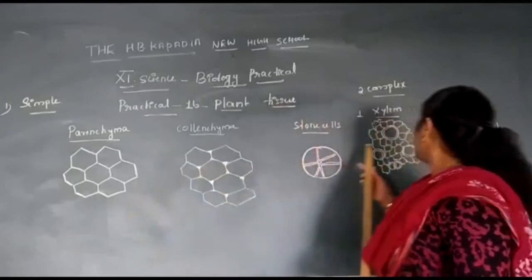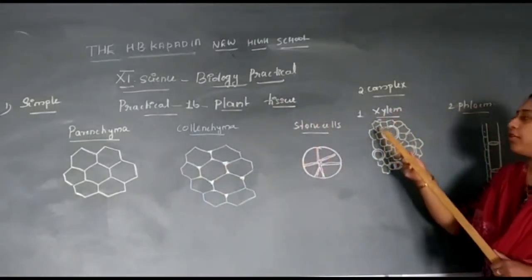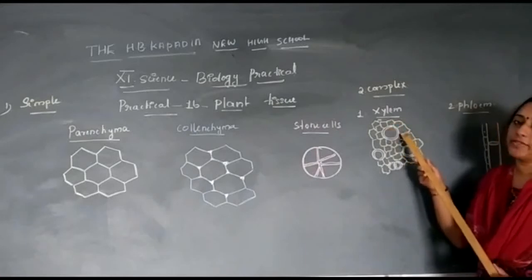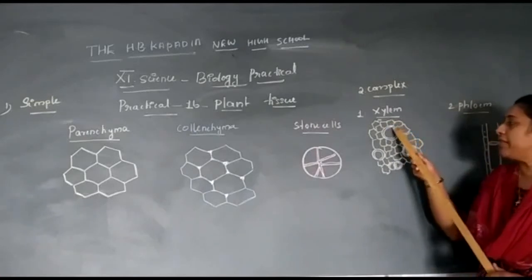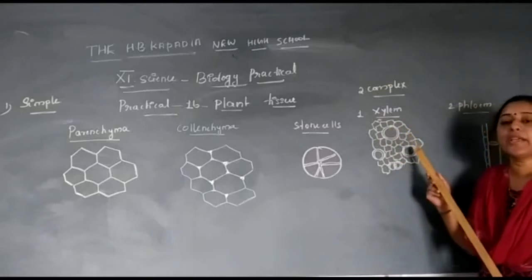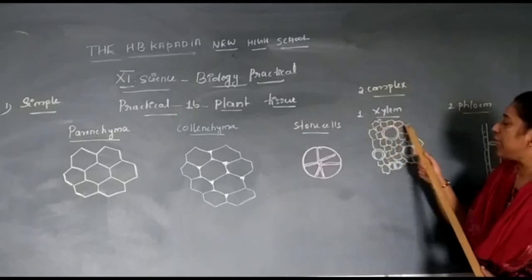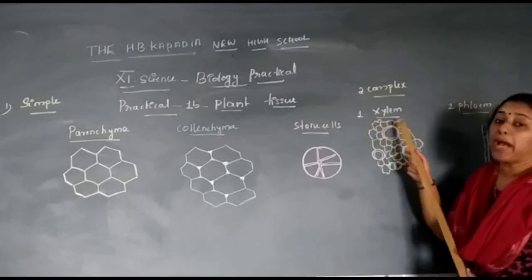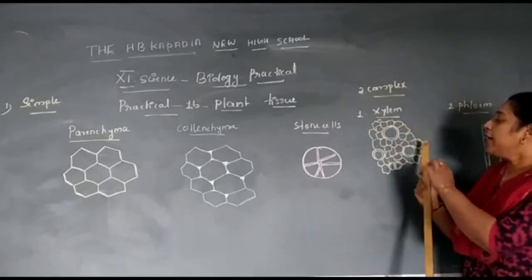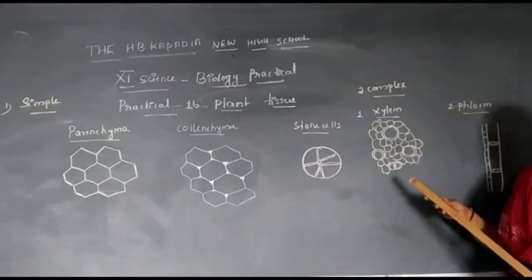Okay, so when you take a section of the xylem, it will appear in this way. These are some cylindrical vessels. When you take a TS, it will appear just like a circular cavity, and in between you can find these yellow color structures, these are parenchyma. These are providing a structural arrangement. It's a packing structure.